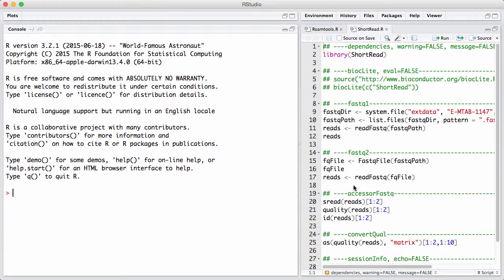It also contains functionality for reading in aligned reads, although a lot of that functionality is now dated and you should be using the Rsamtools package instead. Finally, it has some old functionality for examining base level calls, by which I mean intensities before you do the base calling on an Illumina machine.